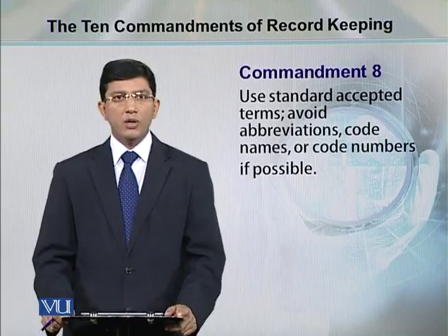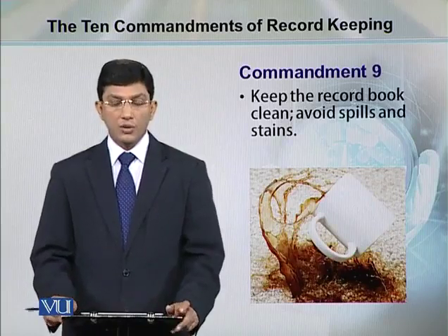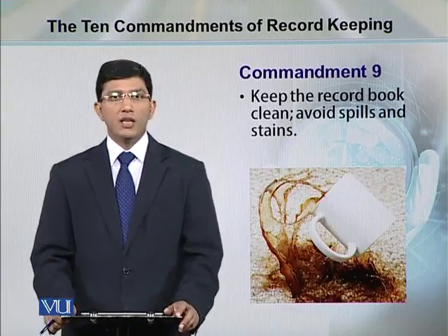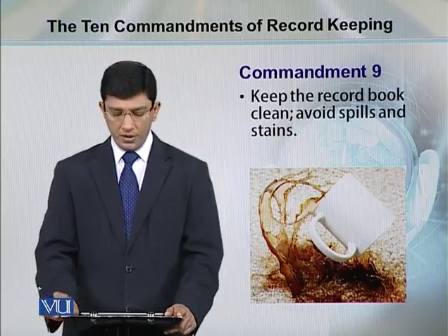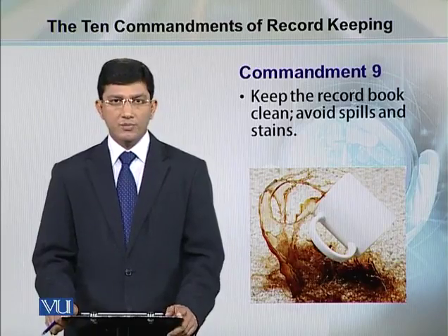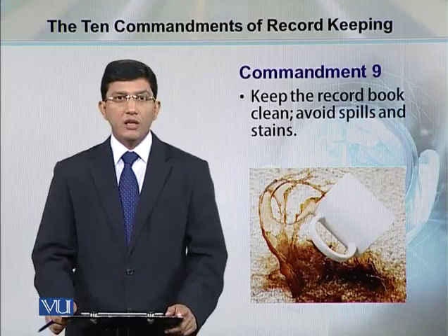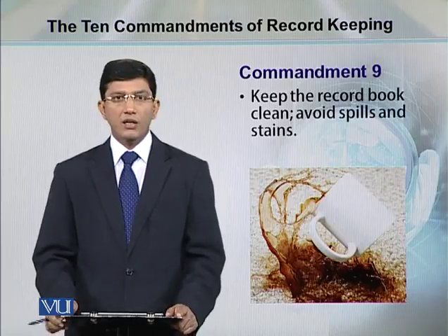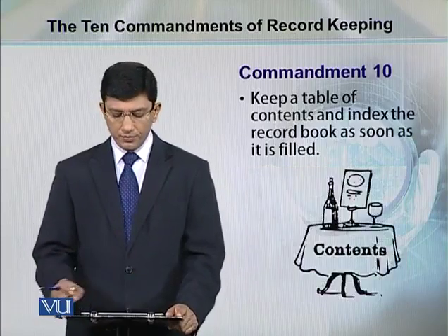So that is the reason we always say use standard approved abbreviations, and if you have to use code names, give a list of the code names. Commandment number 9. Keep the record book clean and avoid spills, because spilling can destroy your notebook and very important data in the laboratory.